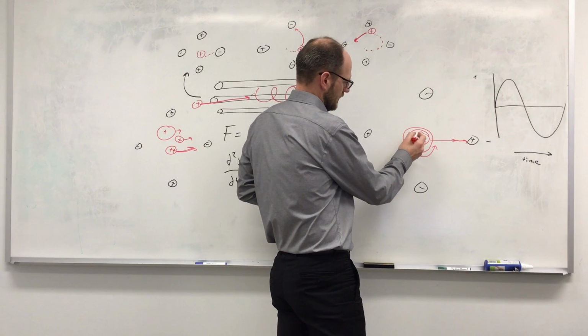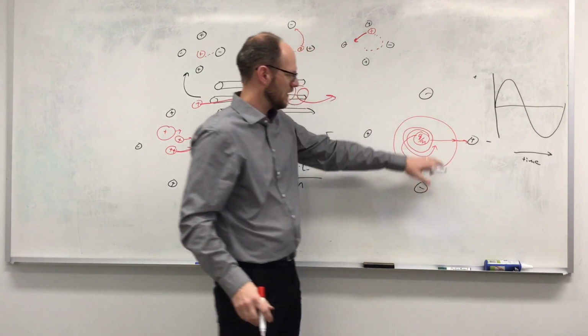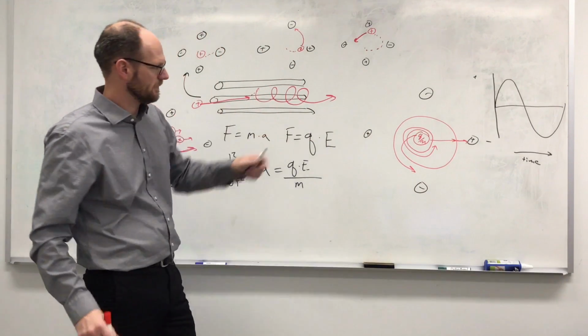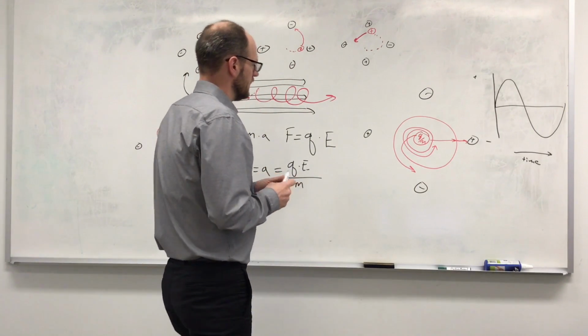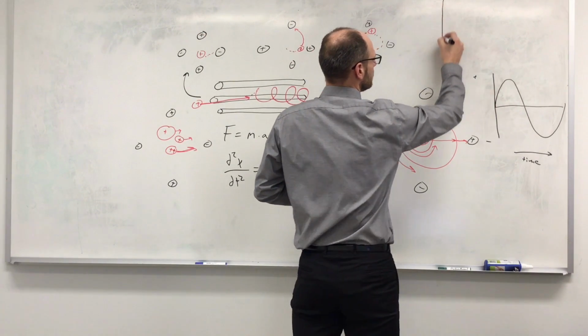And things that are in between will cycle all the way down between the quads over time, just as we showed here. So that's cool because that creates a situation where you can have a mass filter.